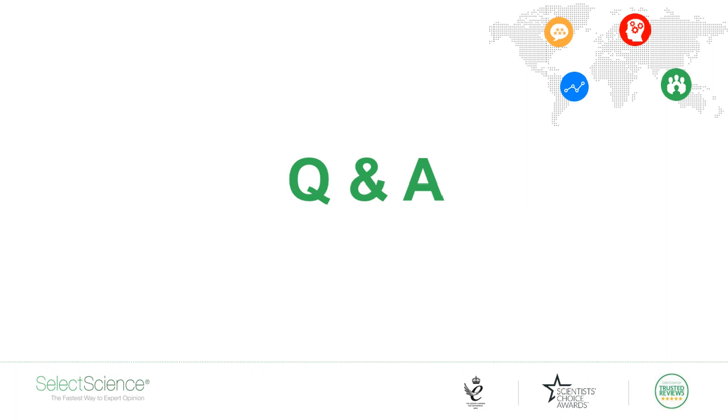What is the maximum capacity of ligands per sensor with the SPR?